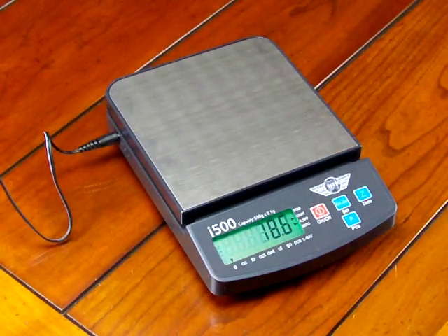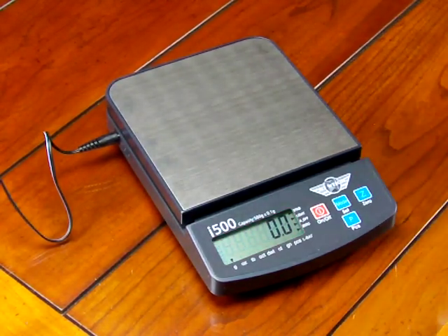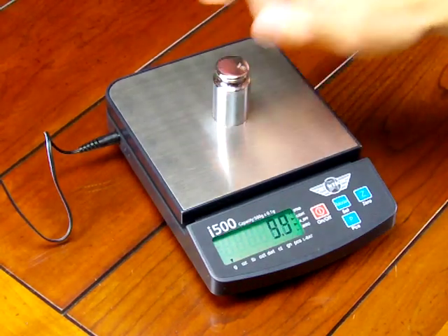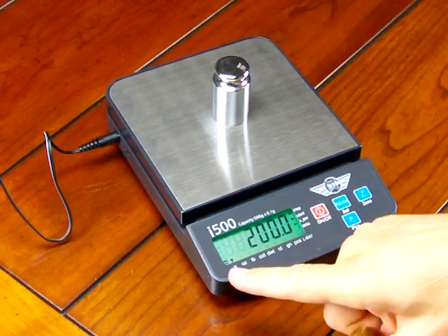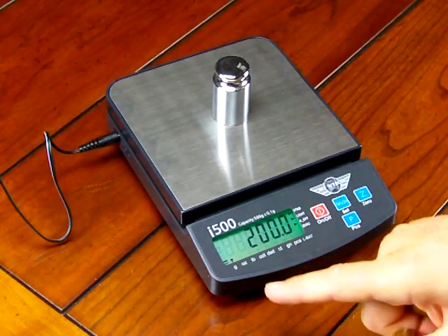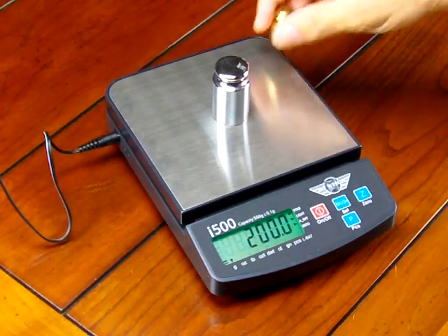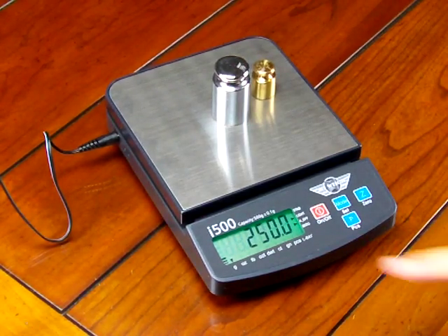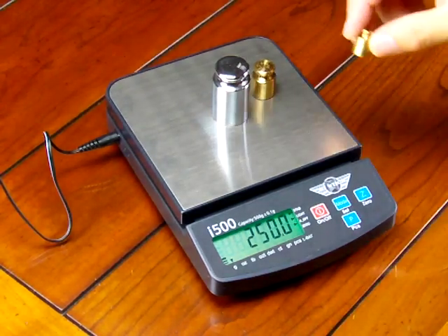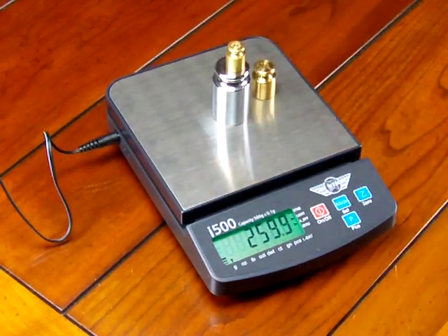We'll put a 200 gram weight on the balance. And then if I were to put other weights on the balance, you'll notice the weigh meter on the left-hand side is giving me an idea of how much weighing capacity I have left. So there's another 50 grams, and then here's another 20 grams.